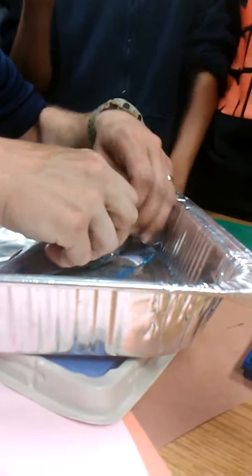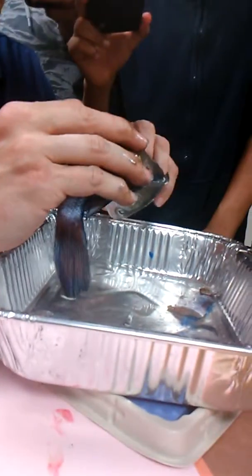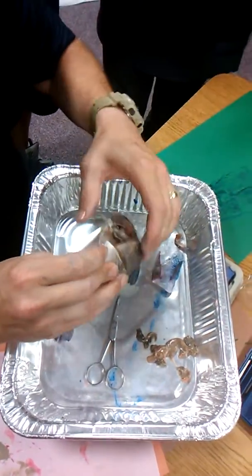You can come in here — this air sac feels kind of like leather. It's kind of hard to see, but there's a little heart that pumps blood. It's attached pretty well in there.